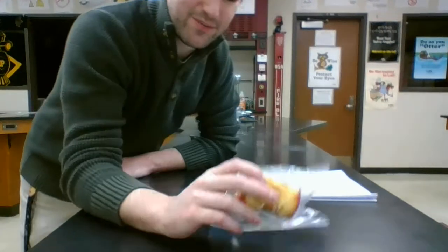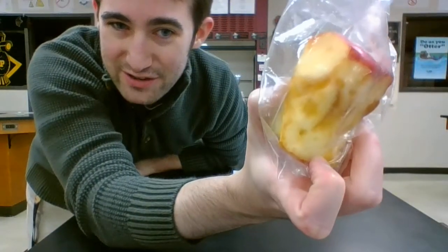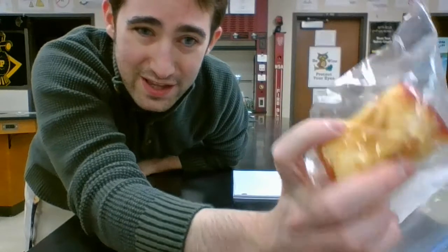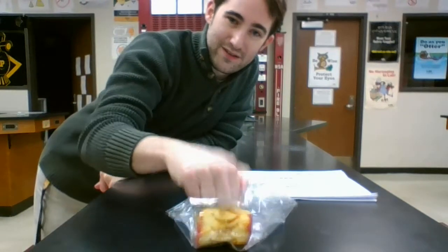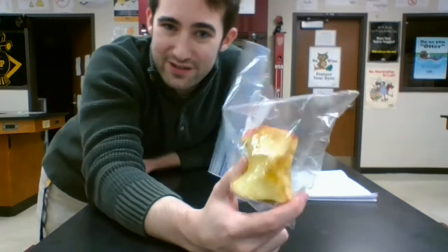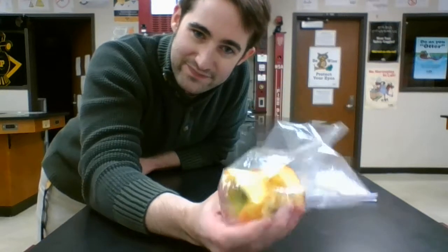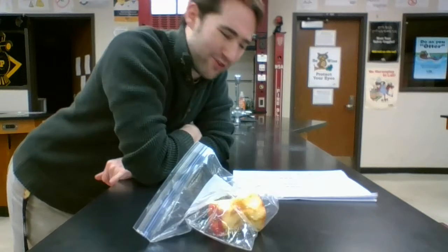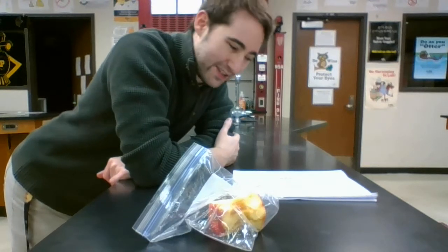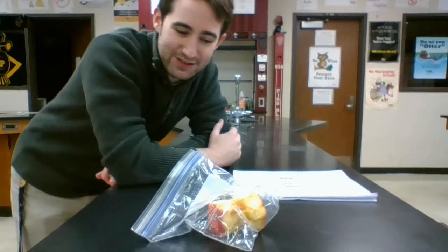It's about what I would expect it to feel like. Okay, you might notice kind of a discoloration, sort of a whitish color, like the lighter yellow is sort of what it would normally be like. You got some darker brown here, so that might be a good clue. Okay, now, in general, you could also figure out what state or phase of matter this is in, solid, liquid, or gas. I've also had this sitting out for about 1.88 days, so we could convert that to minutes to see how many minutes it's been sitting out.